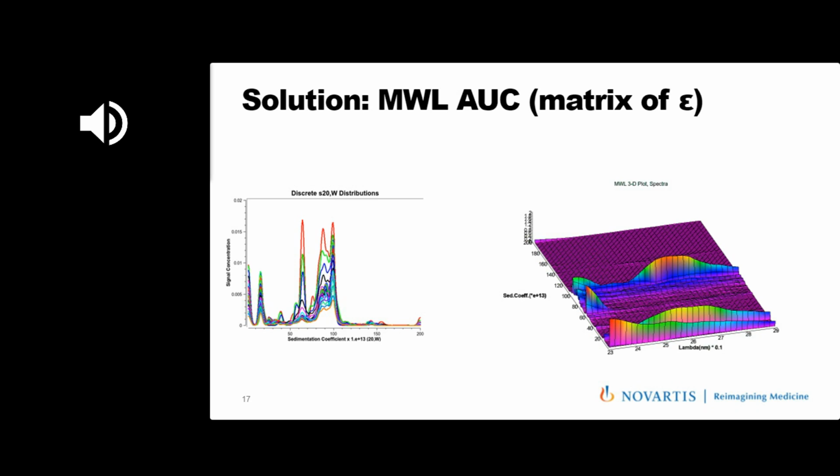Then you have something here at 17S, which is likely the free DNA, which is released because the sample was shipped frozen and thawed again twice. And then there's something which has only a backbone and a very minor absorbance around here. This may be your empty capsid, and you have some species in between. And at the very end, you have a backbone, but a huge absorbance here at 260. So these may be your full capsids, so this stuff here.